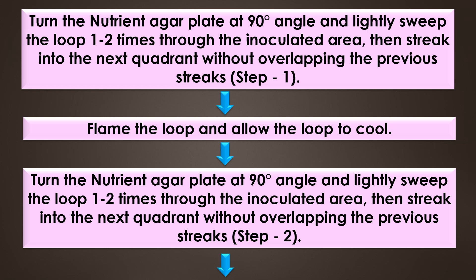After step one, flame the loop and allow it to cool. Next, turn the nutrient agar plate at 90 degrees and lightly sweep the loop one to two times through the inoculated area. Then streak into the next quadrant without overlapping the previous streak. This is step two.